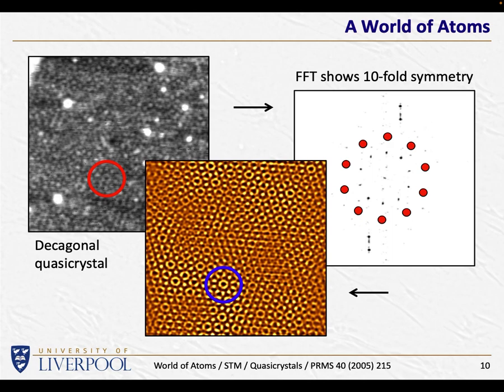So we've been able to process that image using some rather odd-looking techniques in order to bring out the detail, and as far as we can tell, it's bringing out detail that really genuinely is there, but is very difficult to see, but this particular type of processing allows us to bring that out. So this was a very valuable way of imaging and processing particular crystals, in this case an alloy of a number of different metals.